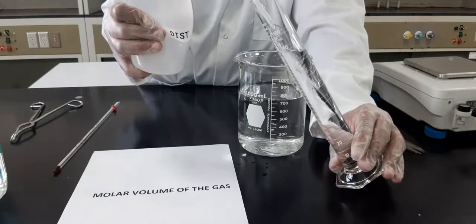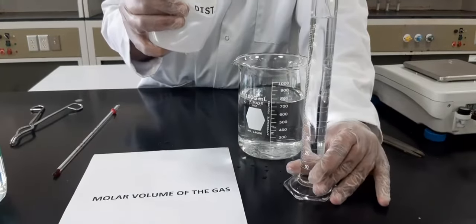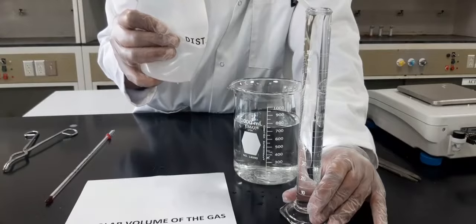You will add water until the water completely fills the cylinder and the water layer looks like this.